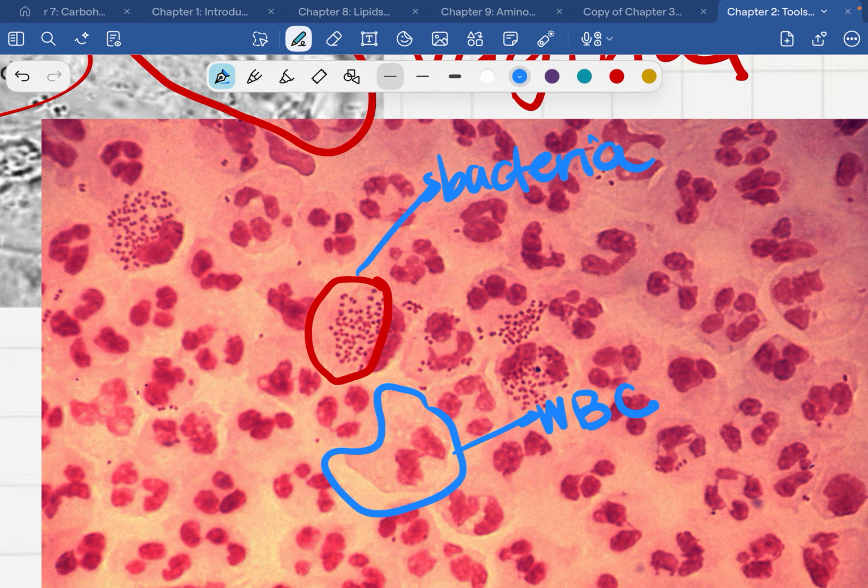Specifically, they're called neutrophils, but they're white blood cells. And you can see, notice all that bacteria, how much of it is in the white blood cells. Like this white blood cell up here, it's got tons and tons of bacteria infecting the inside of that cell. There's one organism that infects vaginal cells, particularly vaginal white blood cells, that is a gram-negative cocci that appears diploid. And that organism is gonorrhea. So this person has gonorrhea. I can tell that from just the microscope.